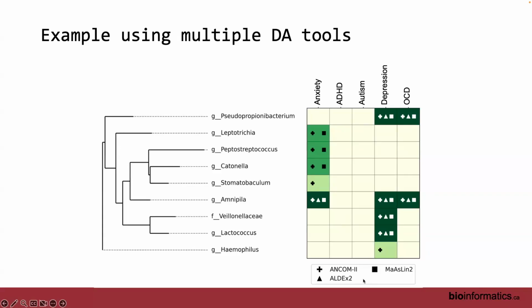Is that what we've been using now? Yeah, usually they seem to all be relatively easy to run. The only issue is that ANCOM came out with another version and the results are wildly different between the two versions. I'm not really clear on what the differences are between them. Other people post issues on it too. Yeah, so that's fun.